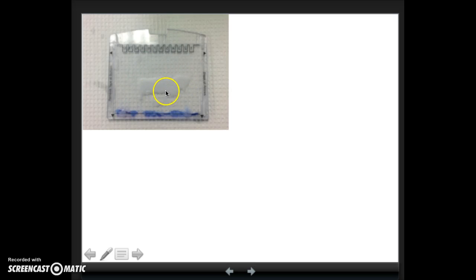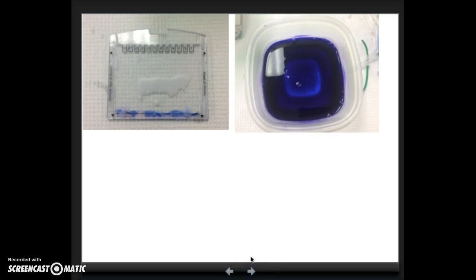But notice we don't see any proteins. This blue didn't dye any proteins; it ran separately from the protein. So hopefully there's proteins that are left at various places in the gel when we stop the run. Our next step is we want to crack open these two plates, peel our gel out, and add our gel to our staining solution. We're staining our protein with a Coomassie blue stain. That Coomassie blue is the same dye that's in our Bradford reagent. It's going to bind to proteins and turn them blue.